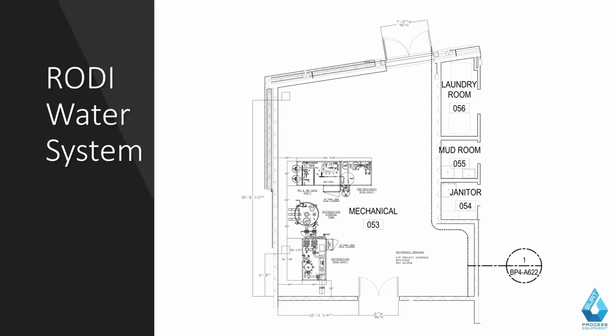You have a fair amount of different maintenance and access around these. This is your pre-treatment system here. These are your water softeners. There's your actual RO unit. I'm sorry, this is your carbon bed. This is your water softener. This is where you have your brine tank. Storage tank, those are your vent filters there. This is your distribution system, controls. You have UV pull-out space. You need access on a fair amount of size for a system like this. This is a fairly common arrangement that would support a central lab-based design.